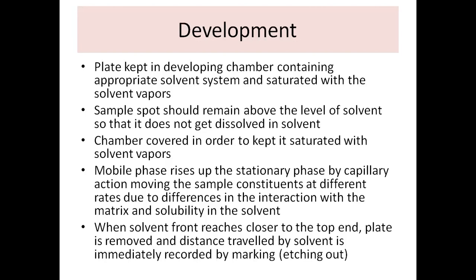Okay. So then you allow that mobile phase to rise up the stationary phase, that is by capillary action. And then along with the mobile phase, the sample spot also will be carried. And as I told you, at every point in that movement, there is an interaction taking place between the sample components and the stationary and mobile phase.